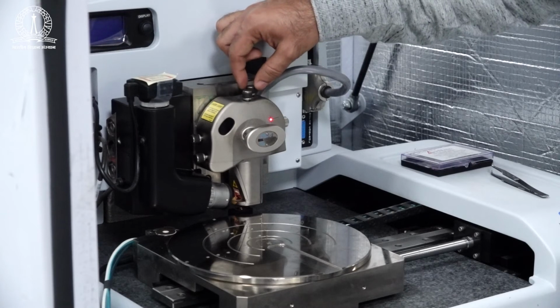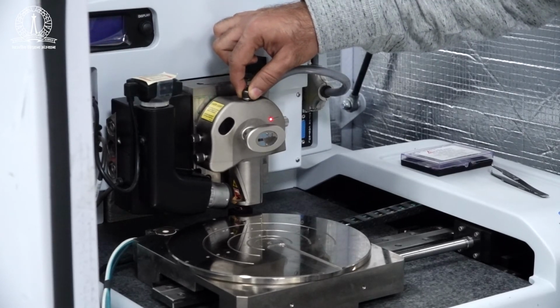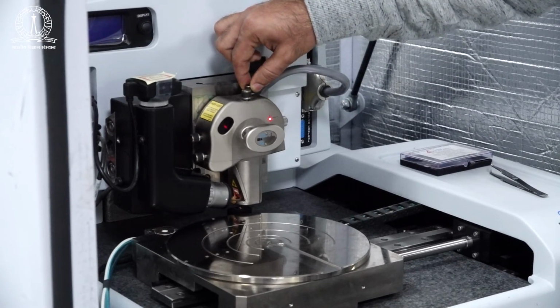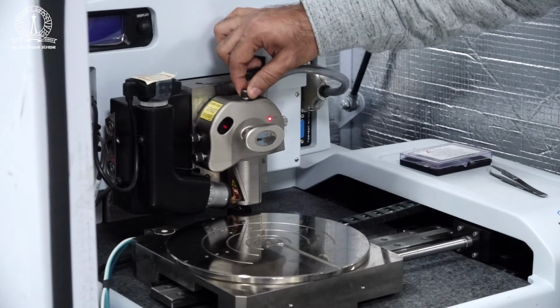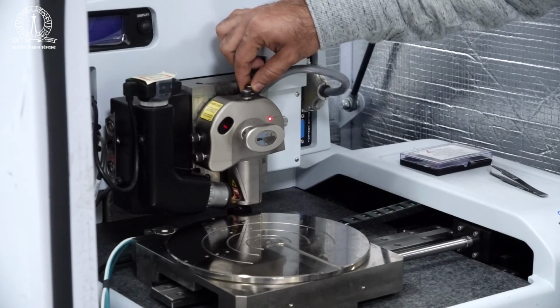Once the laser is in front of us, there is no confusion. You can move this Y knob to adjust the position of the laser onto the cantilever such that we get a good voltage output on the photodetector. And this laser spot should be at the end of the cantilever and not at the base of the cantilever. It should be somewhere here.